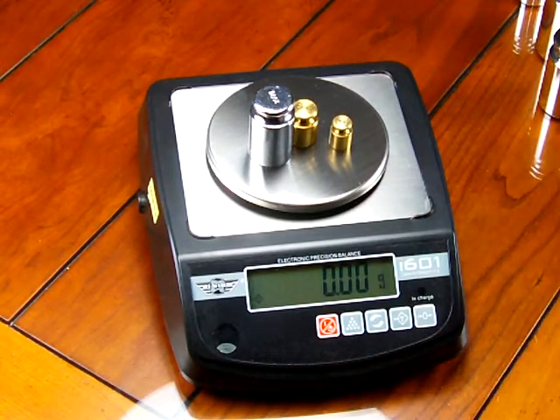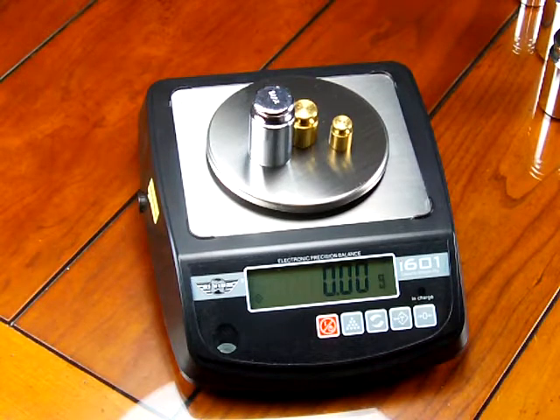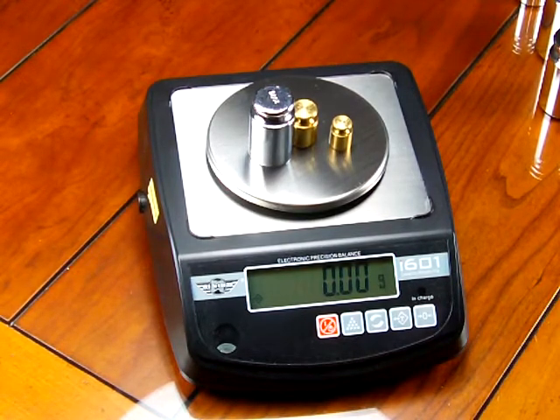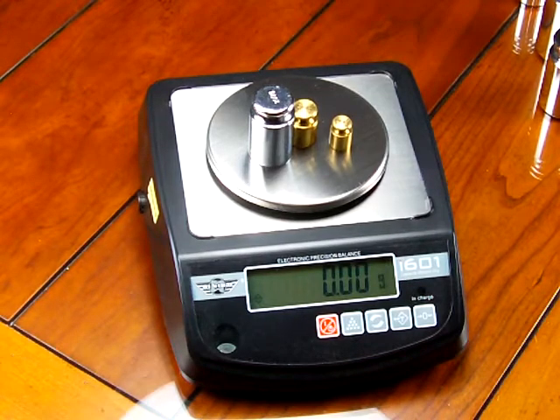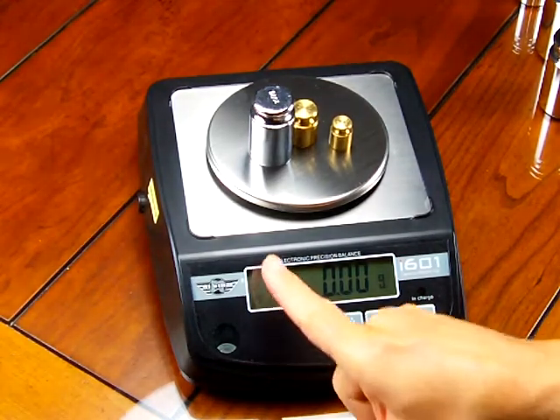Another thing that I'm noticing with this new display, on the LED display that they had before, the LED display is on the MyWay IM01.